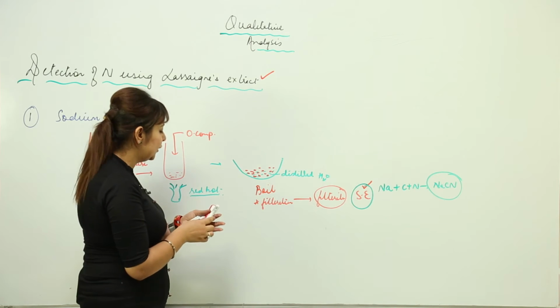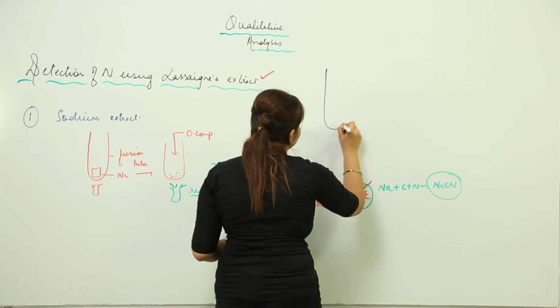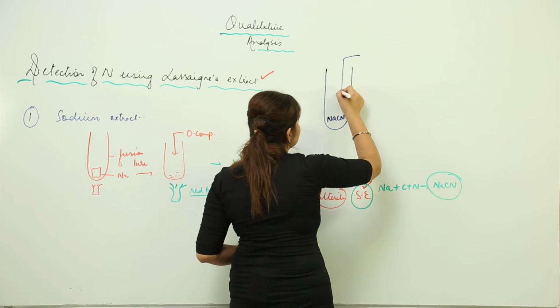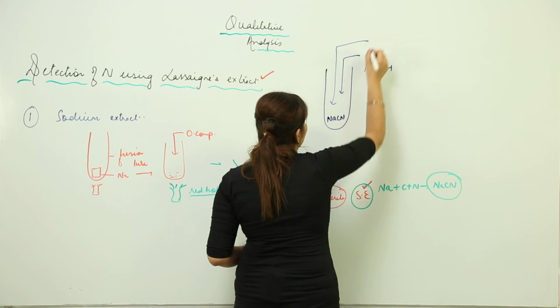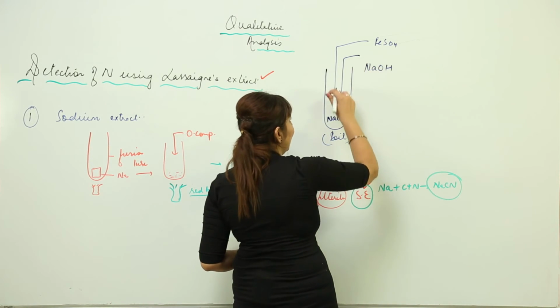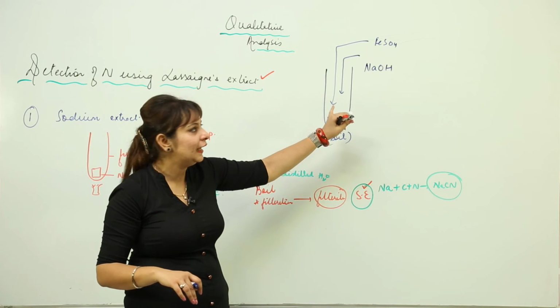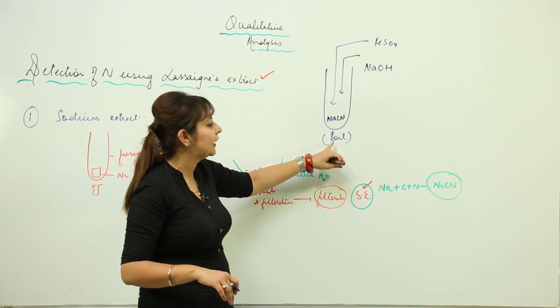Now, in order to detect the nitrogen, we take another tube in which we have NaCN. It is made alkaline by adding NaOH, followed by the addition of FeSO4, and we then boil it. The reason behind the addition of NaOH is to make the solution alkaline, and the FeSO4 is added next, and then it is boiled.